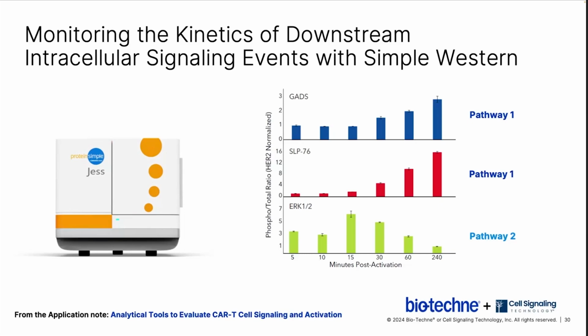15 minutes passed before activation of GADs and SLP76, as represented by phospho total protein ratios, was observed and continually increased up to 4 hours. Meanwhile, maximal ERK activation was seen at 15 minutes, and this was a 2-fold increase that we observed. And then ERK activation decreased steadily after this. Together with the Whitlow linker data to quickly track CAR expression, we can get a clearer picture into the signaling cascades that are regulated under CD19 CAR activation.